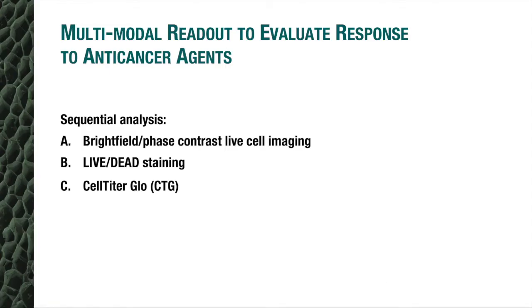So this shows some of the examples of how we can utilize these tumor-specific 3D culture models for various applications in drug development, from drug screening to patient stratification to looking at various immuno-oncology agents. Since patient samples are a very precious commodity, what we wanted to do was identify a way to get as much data as possible from a single sample. This is where we brought in the multimodal readout, so we can look at the response and at different parameters within the response.